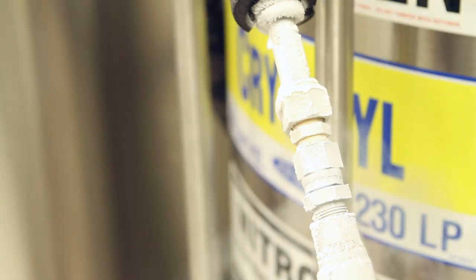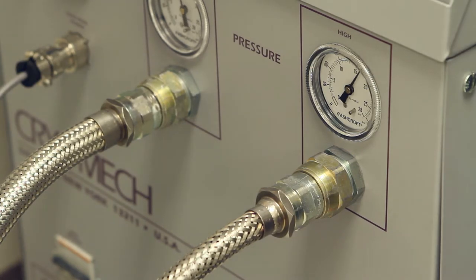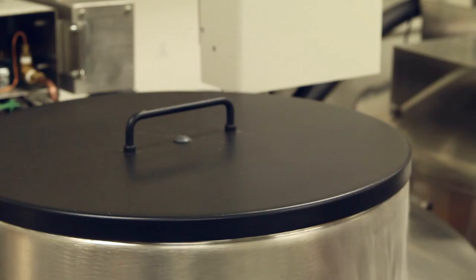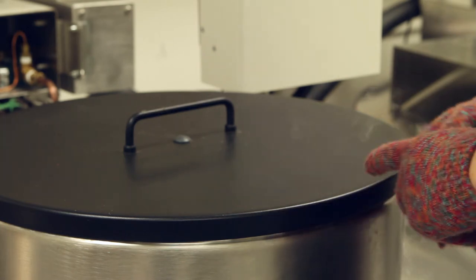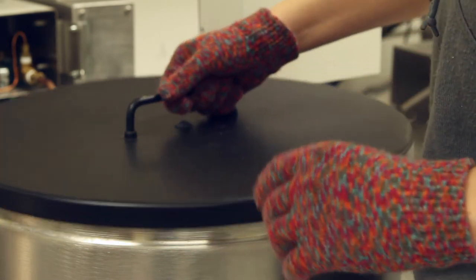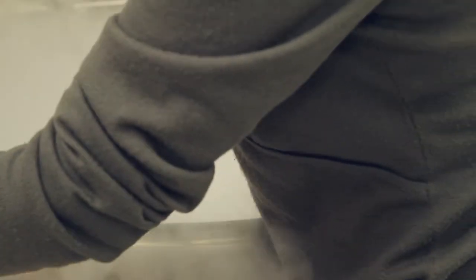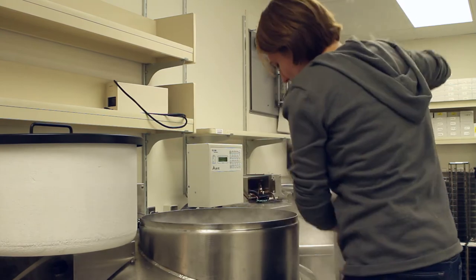We have over 175,000 samples from fish, mammals, birds, invertebrates, you name it. And we take several different types of tissues, so we have muscle, heart, kidney, the typical tissues, but then we also have fecal materials, stomach contents, parasites.